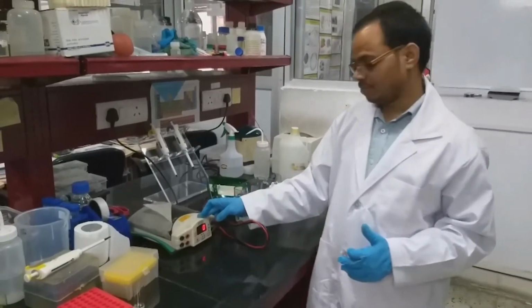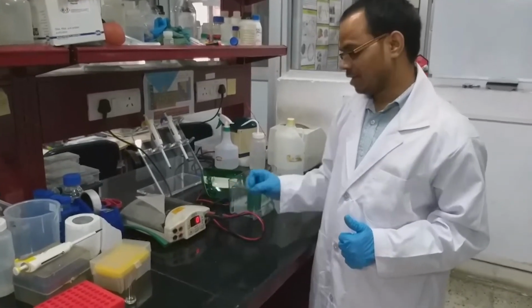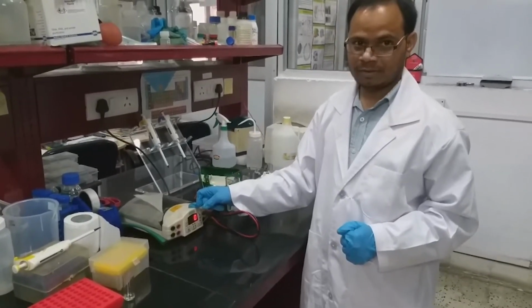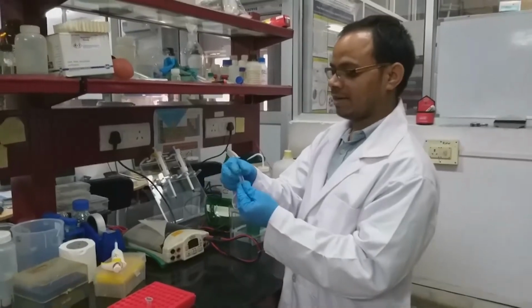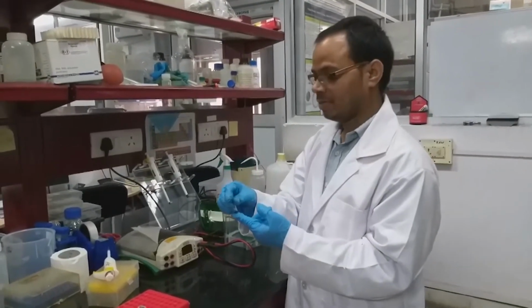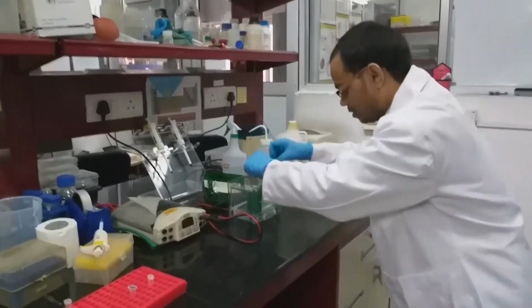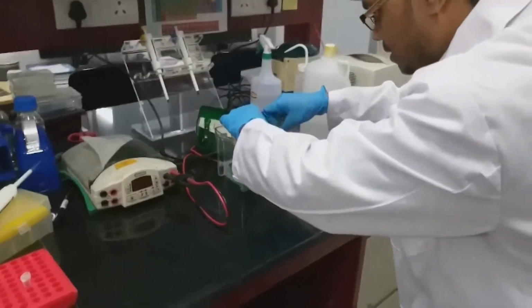This is the power pack where we can adjust how many volts we want to run. The protein samples are ready. We heated for sufficient time. Now we have to load this. So we have to remove the comb carefully.